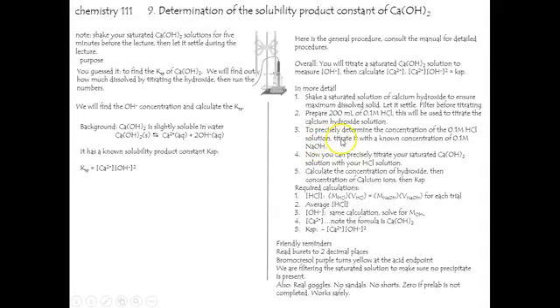Use that, put it in the burette, condition it first, and titrate that 0.1 molar HCl solution as the instructions dictate, and come up with the concentration of the hydrochloric acid, hopefully to at least 3 significant figures. Now you can precisely titrate your saturated calcium hydroxide solution.